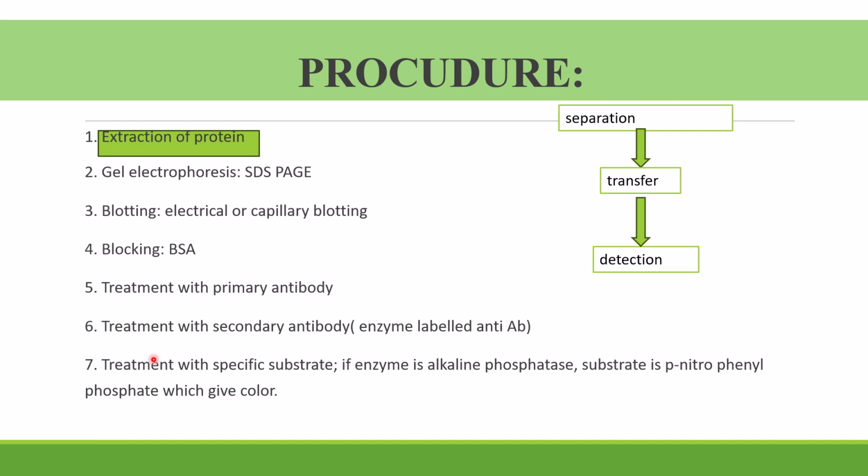Then treatment with the secondary antibody. That secondary antibody should be enzyme linked. The secondary antibody is linked with a certain enzyme. Next we have to treat with the specific substrate.